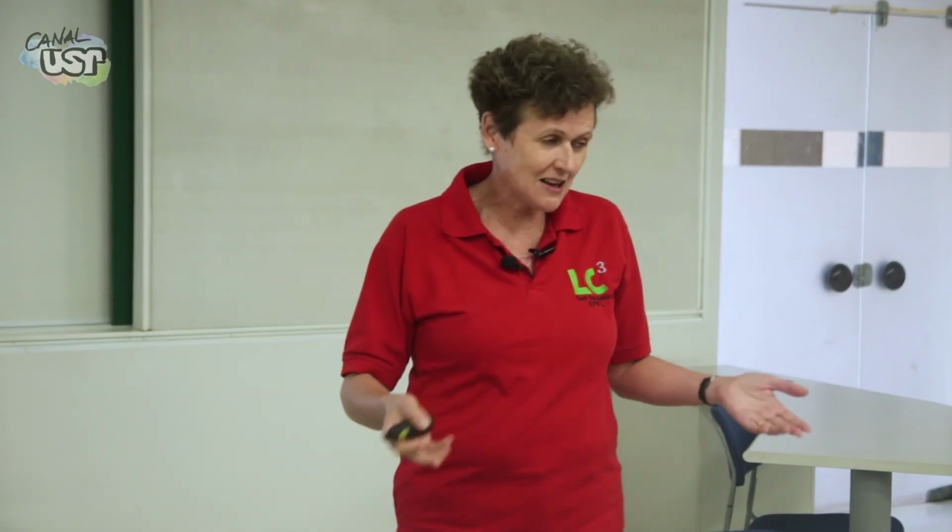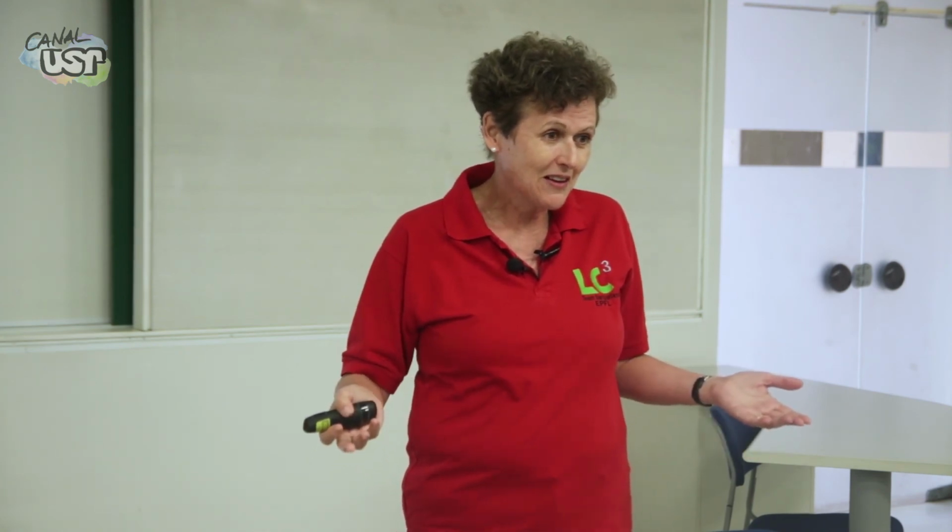So a lot of people waste their time with transmission electron microscopy, which is why I haven't said much in this lecture, because I wouldn't recommend it unless you're working in a lab that's specialized in it. And after training 3 or 4 PhD students, so they spend 1 year learning how to do it, and then they leave, I've given up training PhD students anymore. I have a postdoc who does it for everybody, because it's the only way to be efficient, you know.